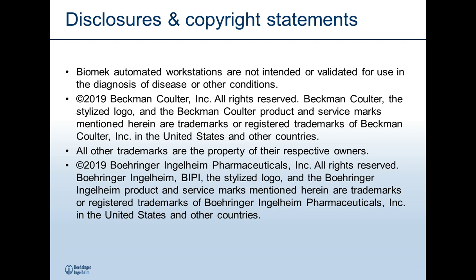Other things that generally escape notice are your lab environment in general. A high degree of air conditioning can cause very dry air, which can increase evaporation. Look at the assay volume versus the plate type that you're working with.